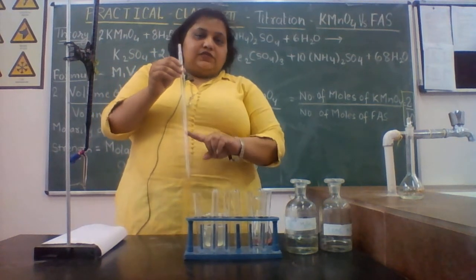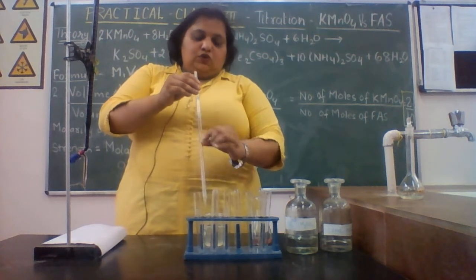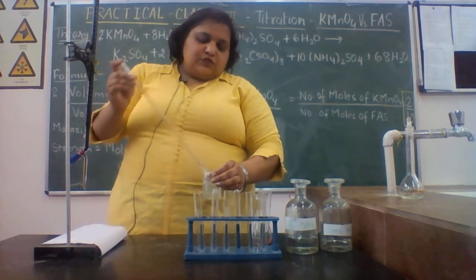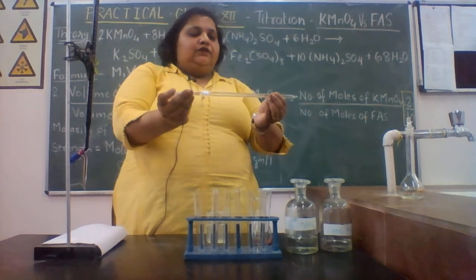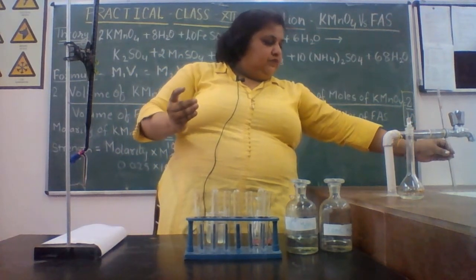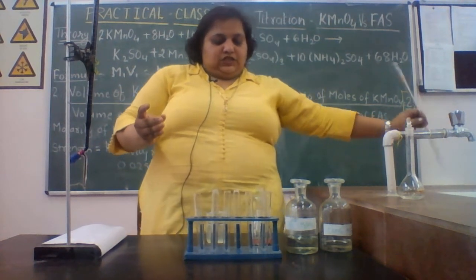Already I have rinsed it with the solution that I am going to use. Again I am just going to show you how to rinse it. Take a small amount of the solution, roll it over and just allow it to flow. Now, your concentration of the solution is not going to change.